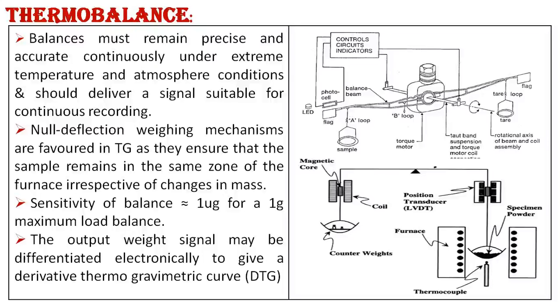The output weight signal may be differentiated electronically to give a derivative thermogravimetric curve, that is the DTG. So these two diagrams give the thermobalance blocks inside the thermobalance.